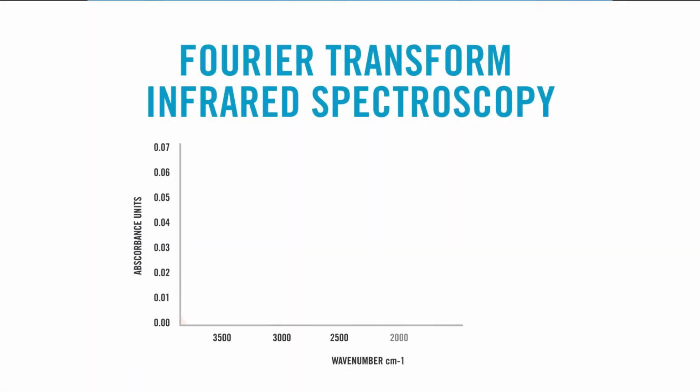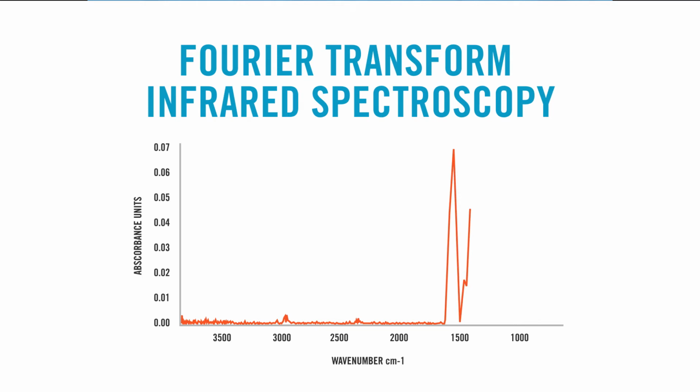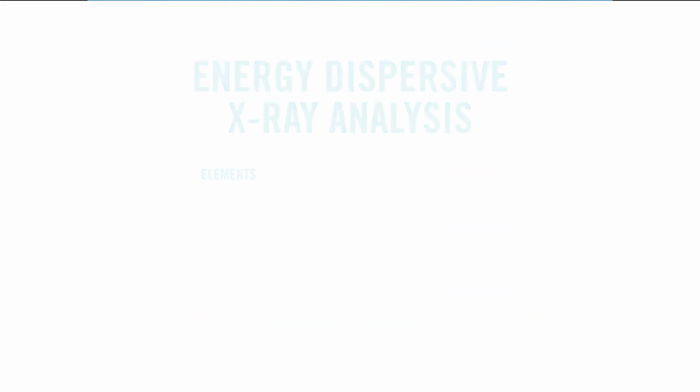Our next step is to look at the foulant using Fourier transform infrared spectroscopy. During this analysis, unique peaks are seen which correspond to different functional groups. This analysis revealed the presence of iron peaks as well as calcium hydroxide peaks. No significant organic peaks were observed during this analysis, so we know that it's not one of their main foulants.